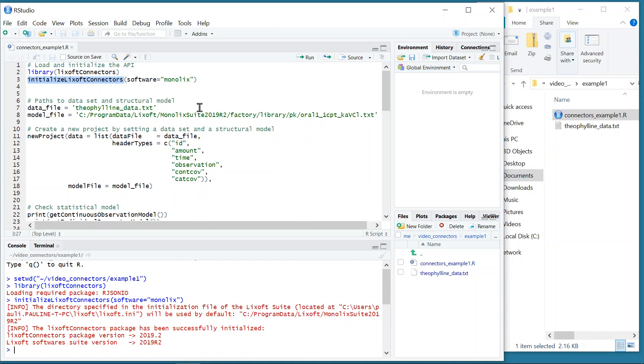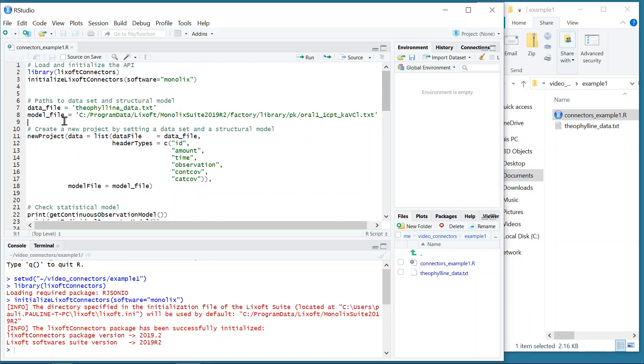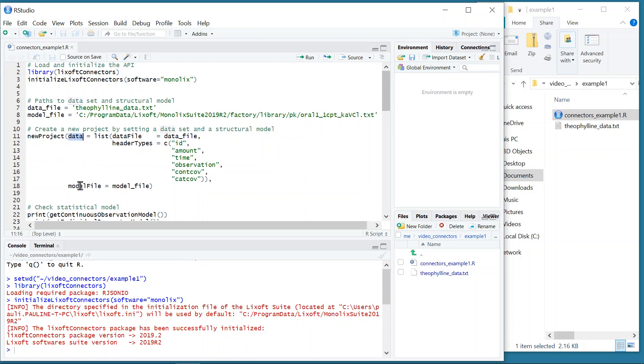In the next two lines, I have written the path to this dataset in the variable data file, and the path to the structural model from the PK library in the variable model file. I then call the function NewProject of the Lixoft Connectors to create a new Monolix project. In the function, I need to define the data and the model. For the data, I give the path to the data file.